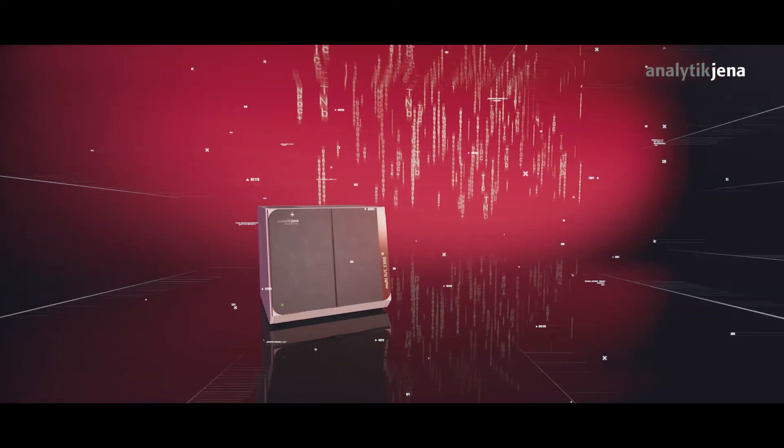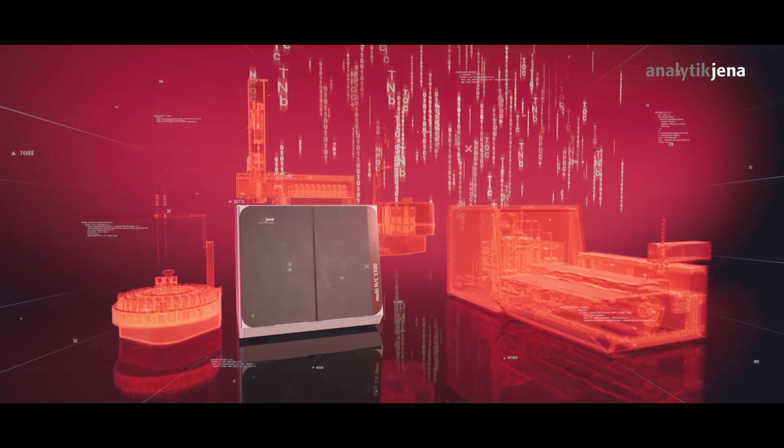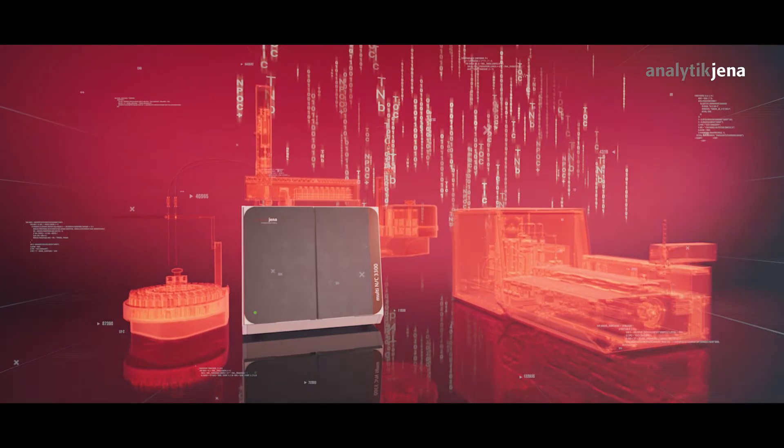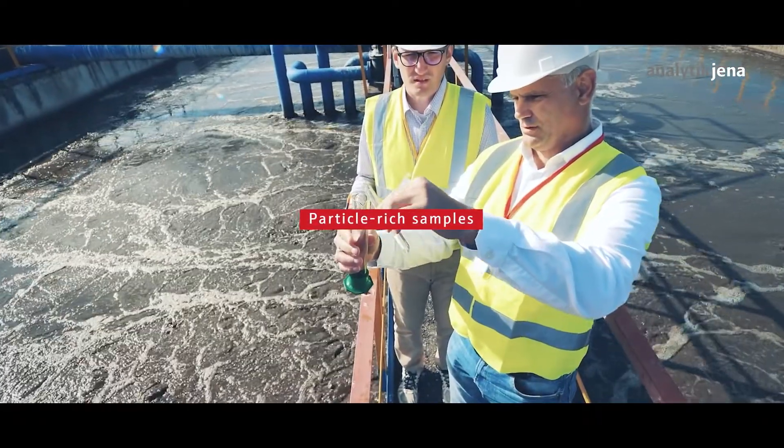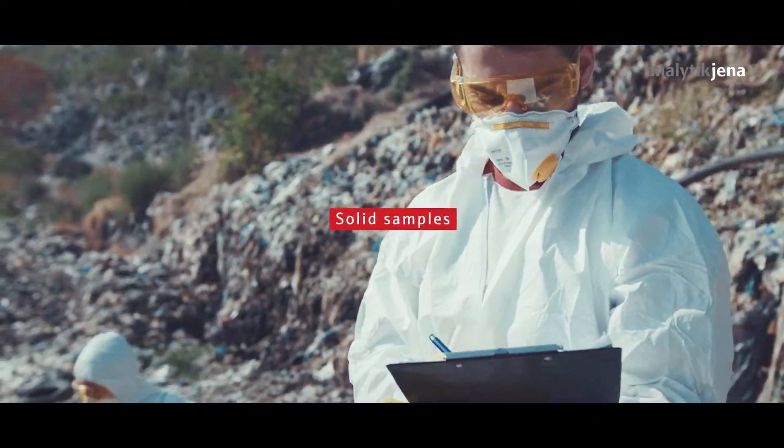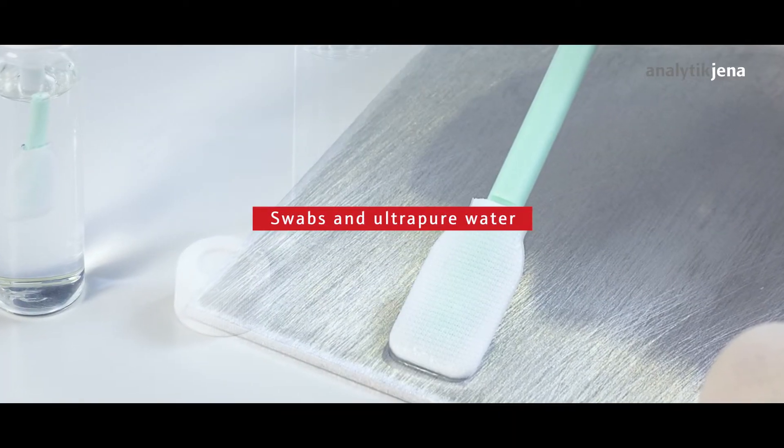An analyzer that is as versatile as your challenges and handles even the most demanding samples with ease. Particle-rich wastewater, solid samples, salts and acids, swabs and ultra-pure water.